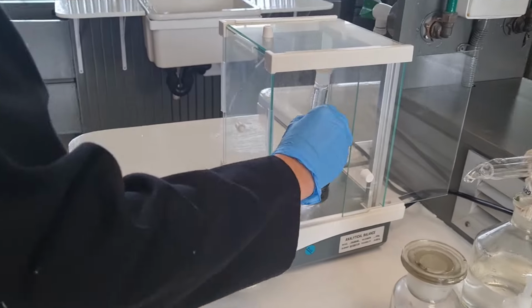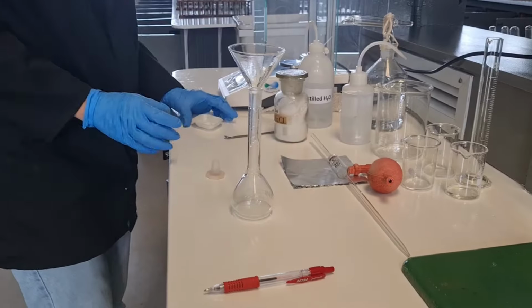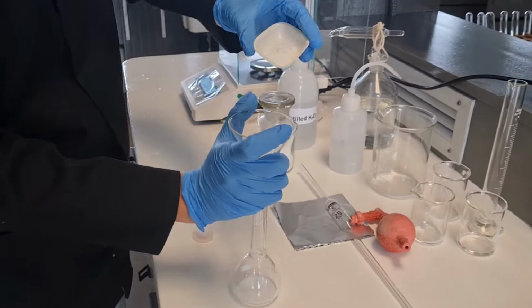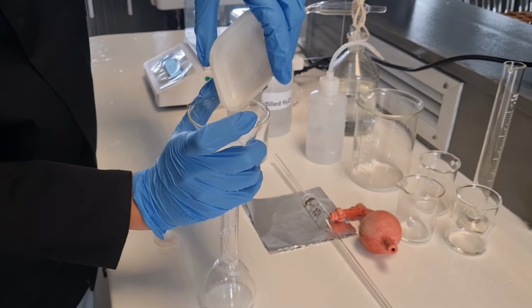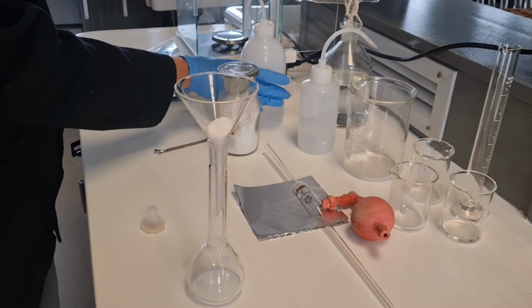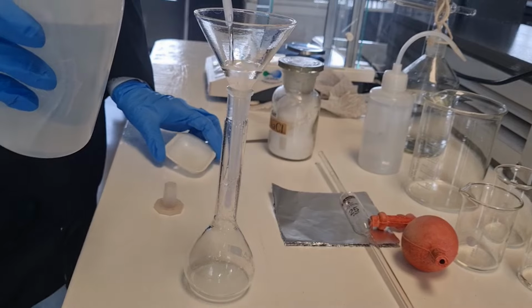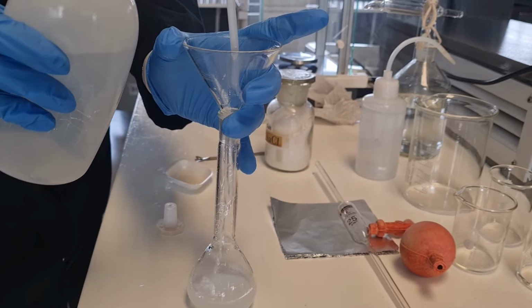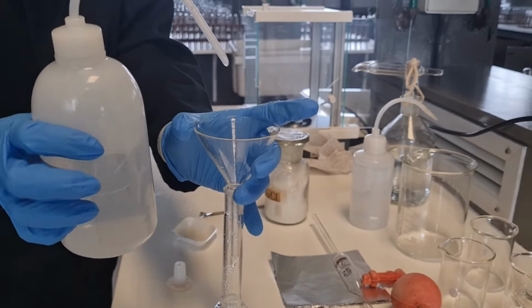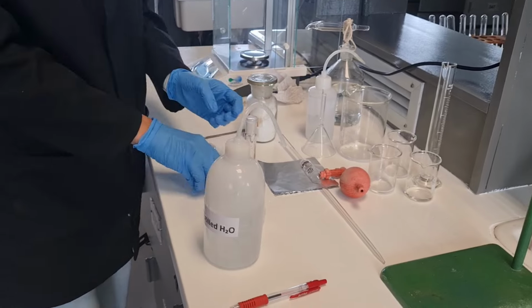Weigh the empty 100 milliliter volumetric flask and record its mass in the table. Transfer the sodium chloride from the weighing boat into the volumetric flask using the funnel and add distilled water from the squeezing bottles provided to ensure that the sodium chloride is transferred quantitatively from the weighing boat into the volumetric flask. Do not use more than approximately 50 milliliters of distilled water at this stage. Then remove the funnel and close the flask.